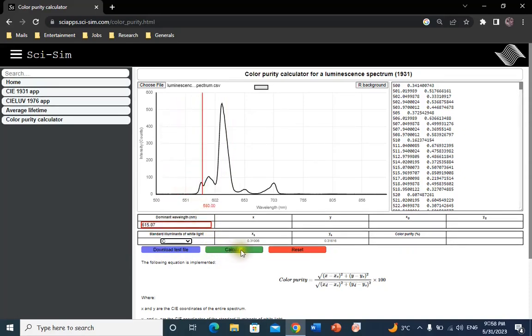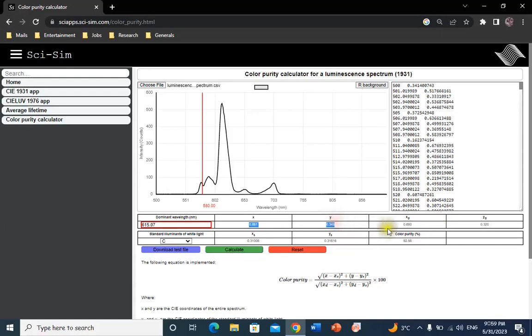Then click calculate. The X and Y color coordinates of the whole spectrum and of the dominant wavelength will be calculated and shown here. The color purity will also be calculated and shown here.